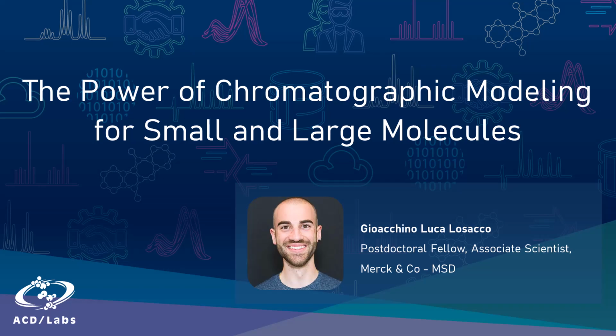I would like to welcome everybody to this presentation in which I will discuss some of the latest examples that we have been working on as the Method Screening and Purification group here in the analytical R&D department at Merck. Some of the latest examples on how we can efficiently integrate chromatographic modeling by use of LC simulator software into our screening platforms to dramatically improve the performance of our screening separations.